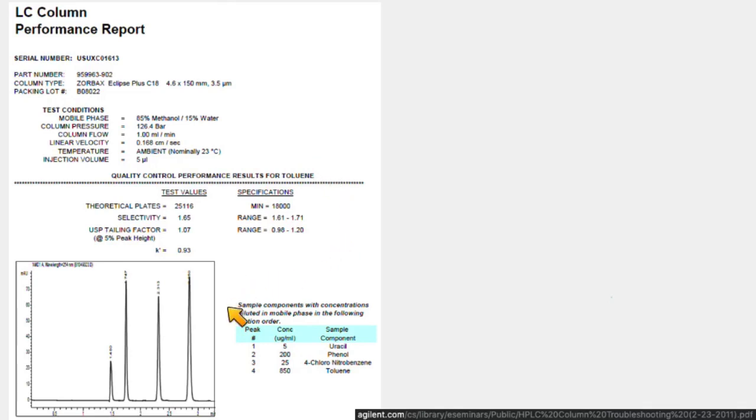They show the chromatogram down here, and here are the components in it. Peak one, the first one, is uracil, then you have phenol, then 4-chloronitrobenzene, then toluene, in order 1, 2, 3, 4. In order to do these calculations, you have to specify which peak you're using, and so they specify that they do these calculations for toluene. Usually they'll use the last peak here, and they calculate theoretical plates, they calculate the selectivity, they calculate a retention factor, although they call it k prime, same thing. We can use this as an example to see how to calculate these things.